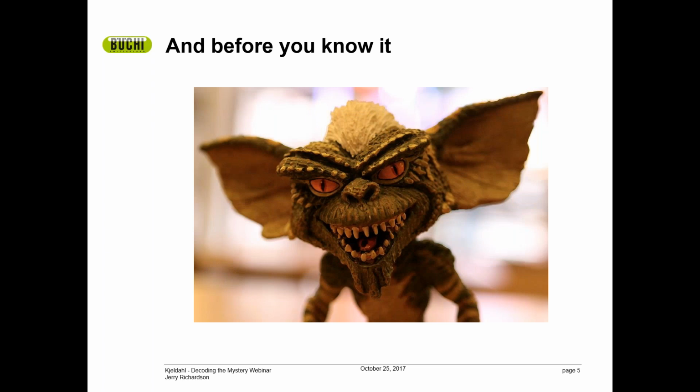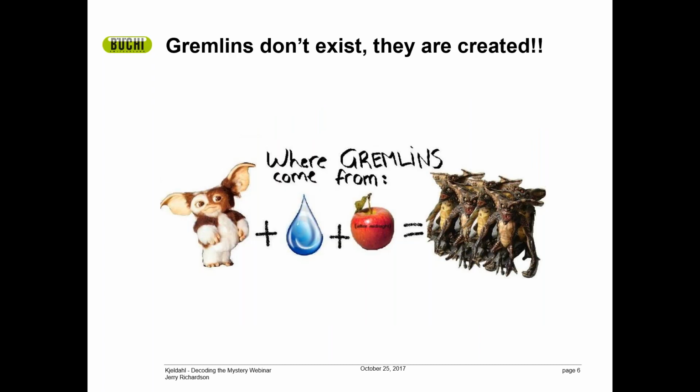Just on a little side note, for Kjeldahl, all technical support by phone and by email is free of charge. So by all means, if you have an issue or a question, give us a call. Don't let it get to this stage, because the one thing that we want to understand is that gremlins really don't exist. They are created, and commonly they're created from a lack of understanding. And sure, there are mechanical failures and electronic failures, no doubt about it, but for the most part, gremlins don't exist in our instrumentation. It's just a matter of our understanding and how we address it and how we maintain things at peak performance.